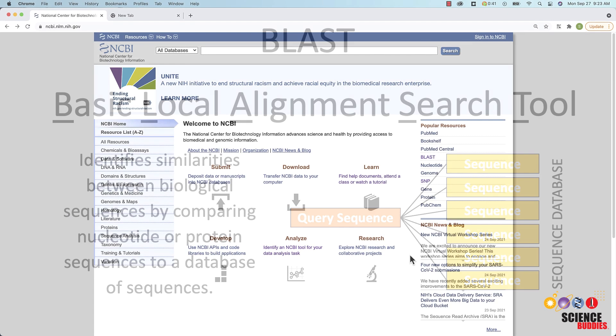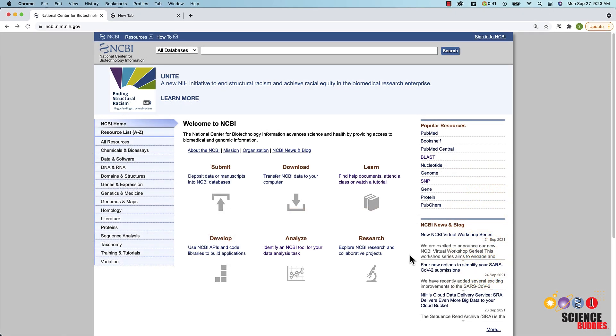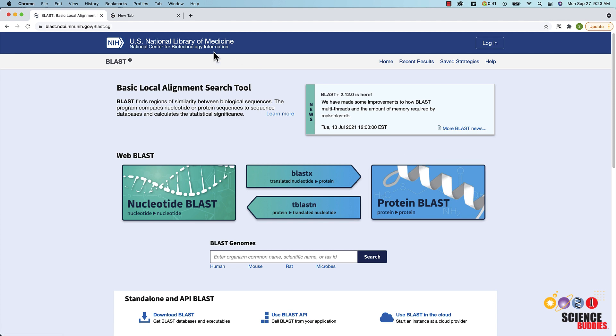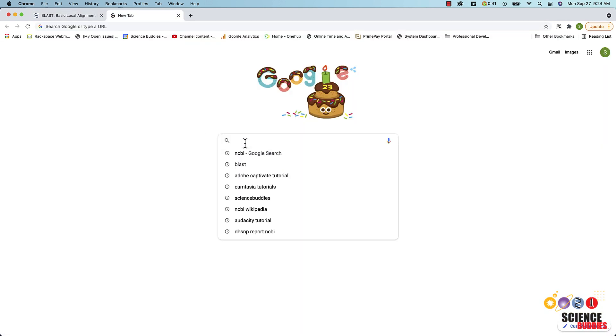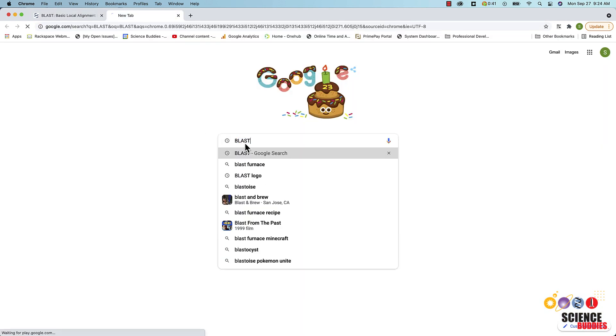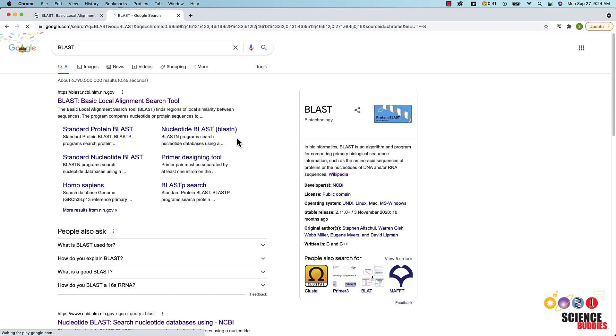You can get to the BLAST website from the NCBI main homepage by clicking on the BLAST link under Popular Resources on the right or by searching for the tool in your web browser and clicking on the BLAST website link.